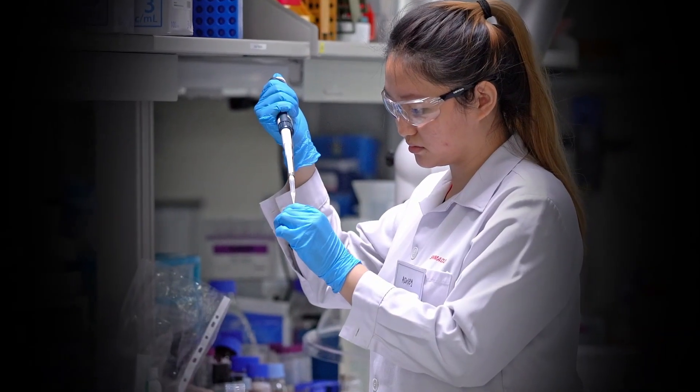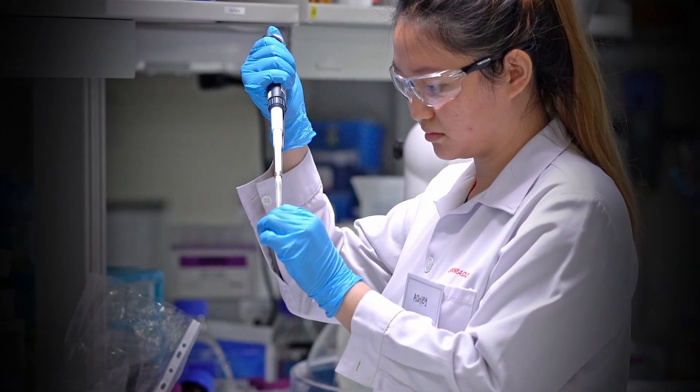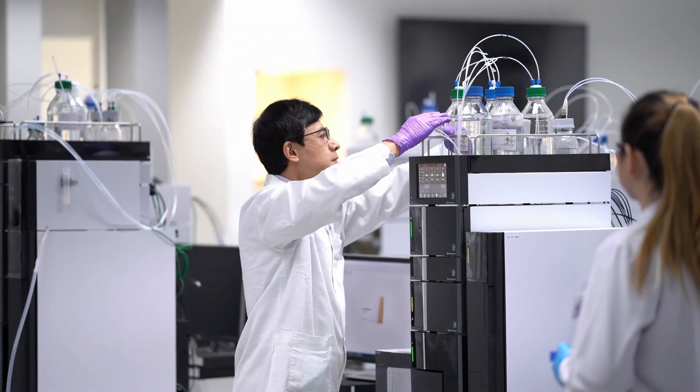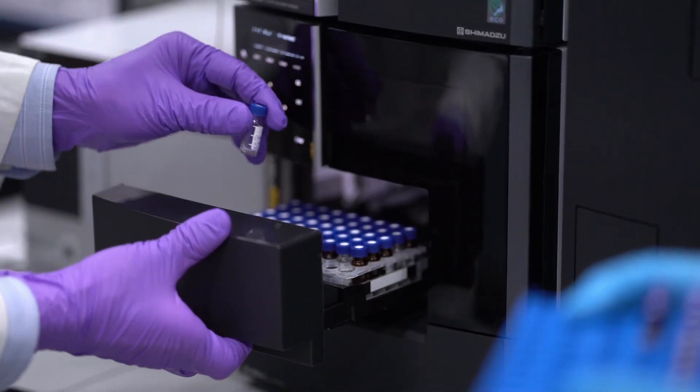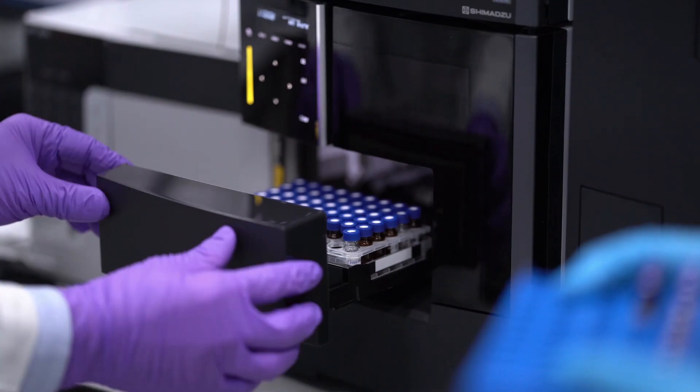Hi, I'm Ashley, an application chemist at Shimadzu. Molecular weight is important information for compounds, especially for macromolecules, where their molecular weight can range from thousands to hundreds of thousands. When working with polymers, determining their molecular weight plays an important role in determining the properties of these polymers.